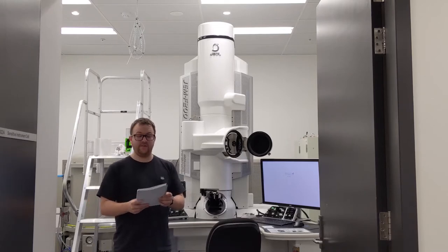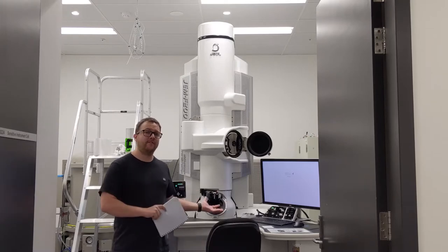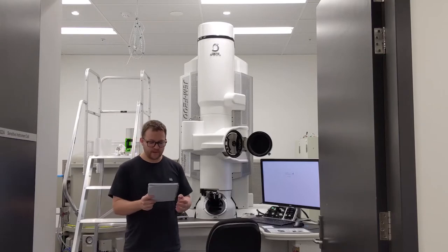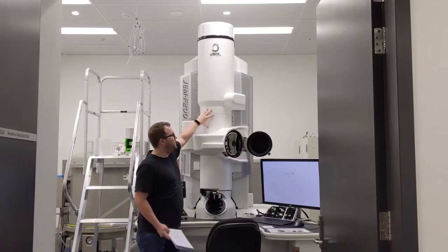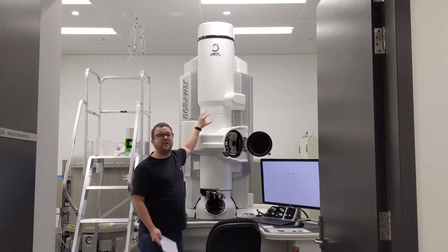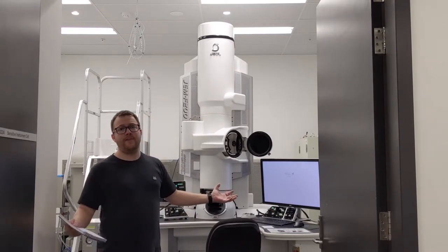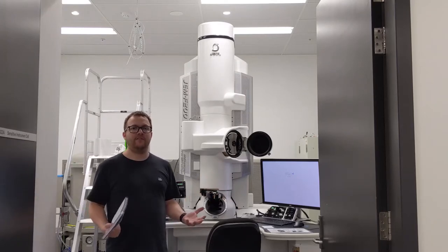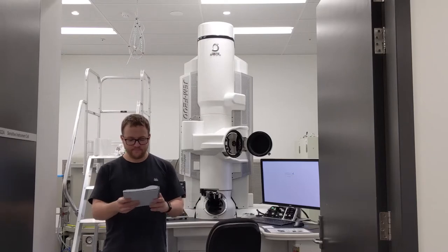And this small wavelength allows us to see much smaller things with the electron microscope than we can with a visible light microscope. Once the electrons have left the gun, they see the first set of lenses. These are the condenser lenses, and these take the divergent beam of electrons leaving the filament and focus them into a parallel array of electrons, which will then hit the sample and interact with it.